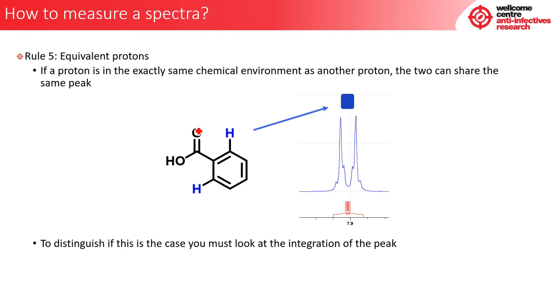Benzoic acid, if I was to draw a line of symmetry through the middle, I could see that the hydrogens identified in blue are identical. I cannot tell the difference between this one and this one. So the NMR detects this, and says, well, actually, I know that both of these are the same distance to this carboxylic acid group, and therefore I'm going to put them together. So, let's draw on the rest of the hydrogens onto this aromatic ring, again with my beautiful drawing, no laughing.